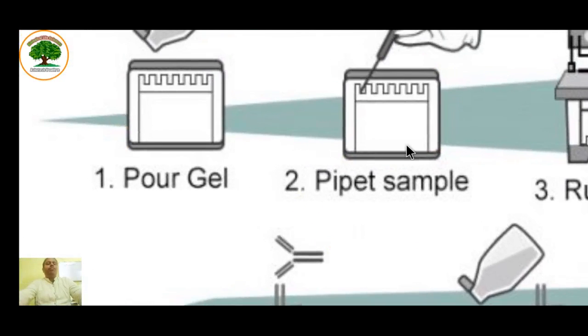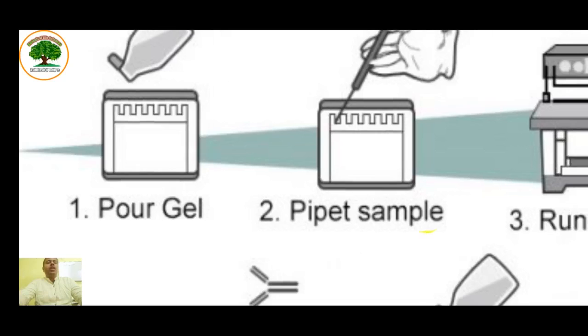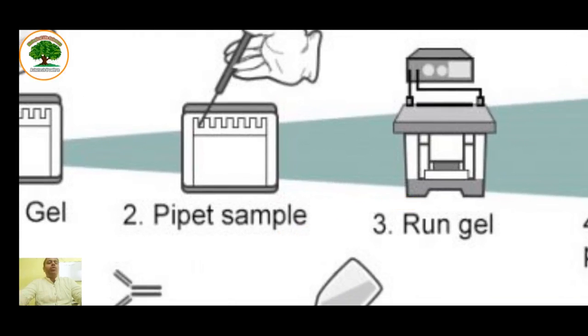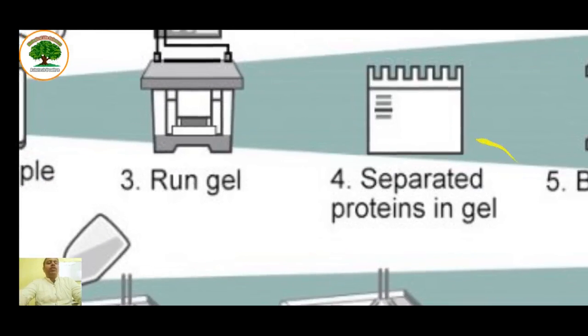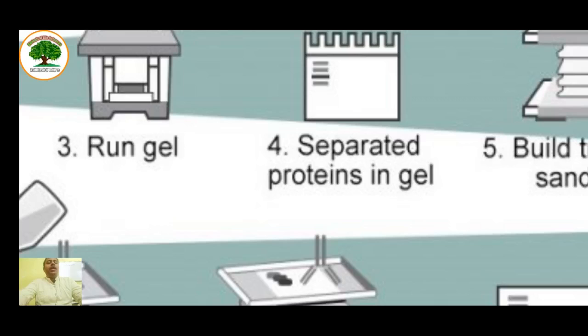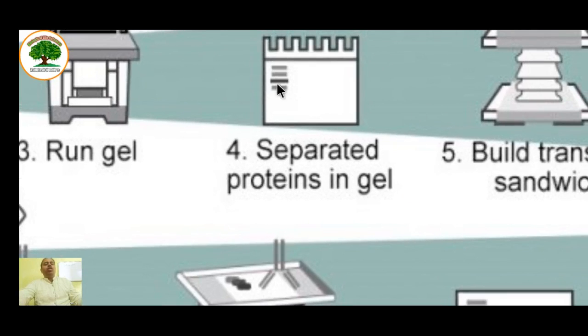First of all, you have to pour the gel, then solidify the gel, then pipette out the samples and load them into the wells. The gel is run first using vertical gel electrophoresis, and the protein is separated. Ideally, we do the separation in two sets of bands. One set of bands is used for blotting onto the membrane, and another set is used to compare after the electrophoresis, so that the position of the known band can be compared.